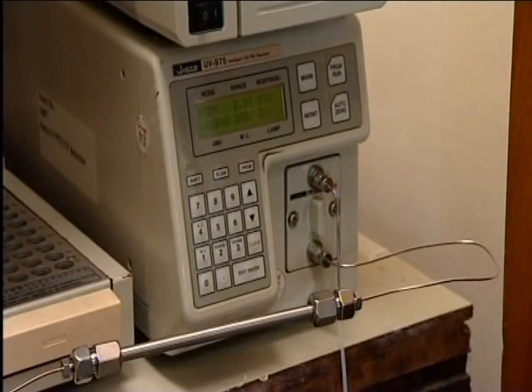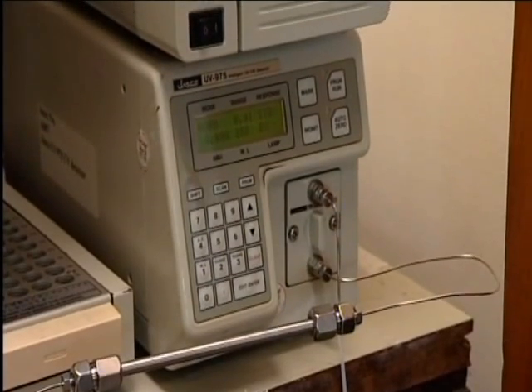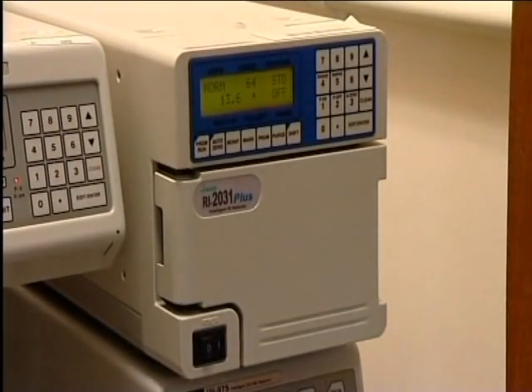Many alternative types of detector are possible. This one measures refractive index. The time that each component takes to come off the column is called its retention time and can be used to help identify it.